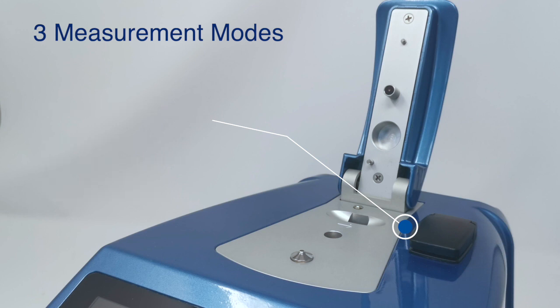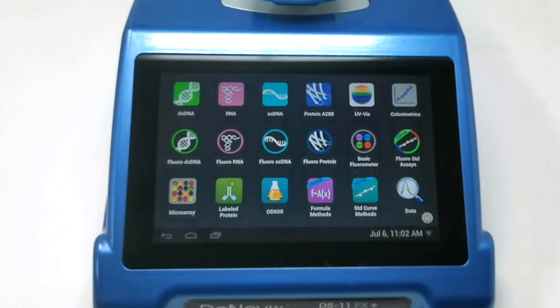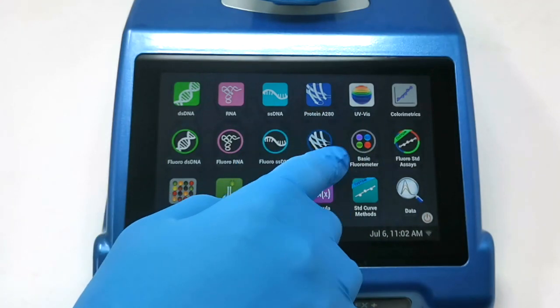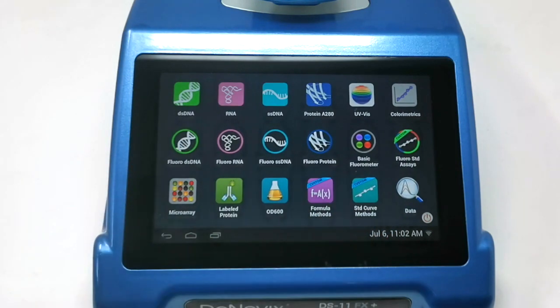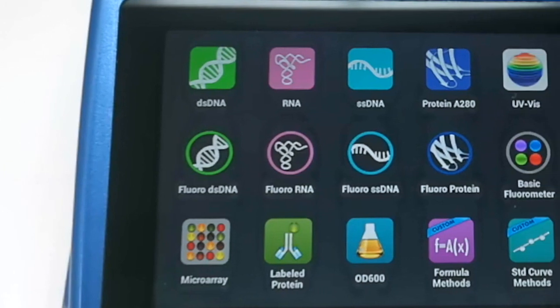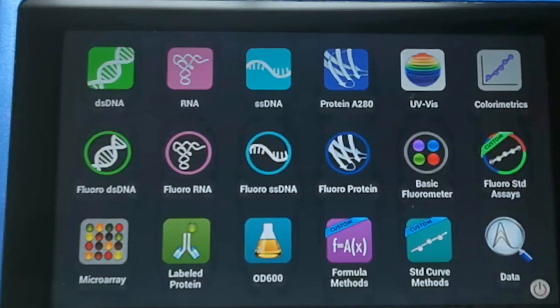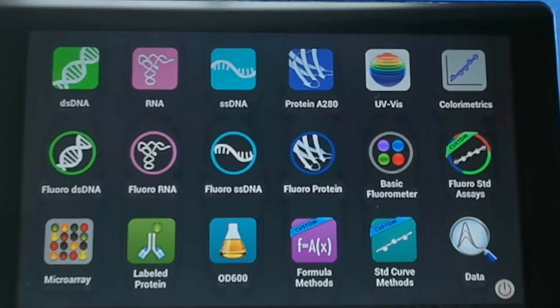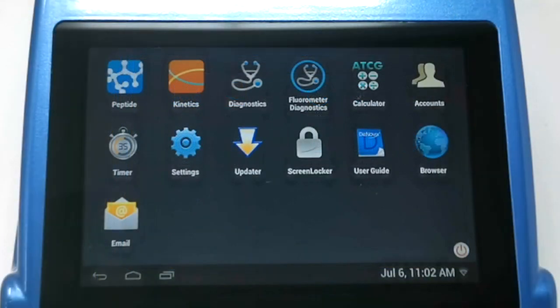The instrument is controlled by a high definition touchscreen interface and all of the applications are separated into measurement apps. On the screen we have a series of square apps along the top and bottom — these are all our UV-vis apps. In the centre we have fluorescence apps, which are all circular by design, and we can swipe through to a second page with additional measurement apps such as peptides and kinetics.